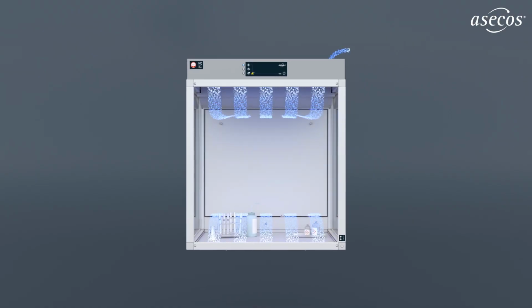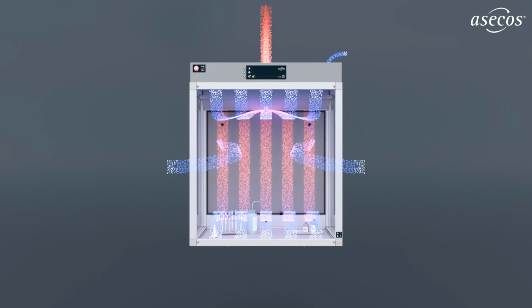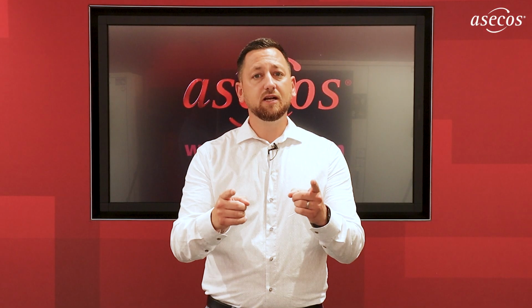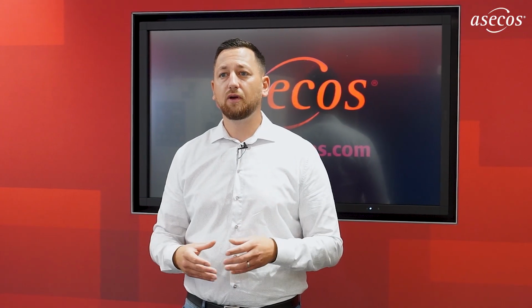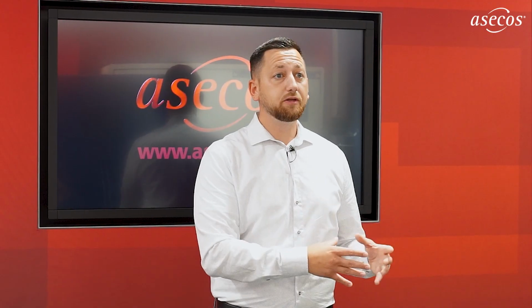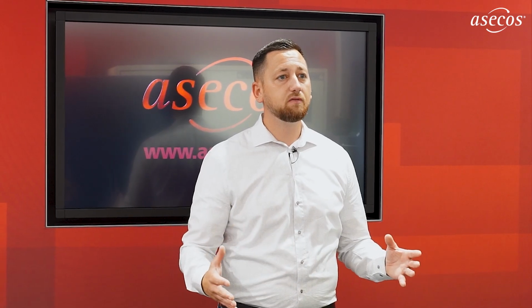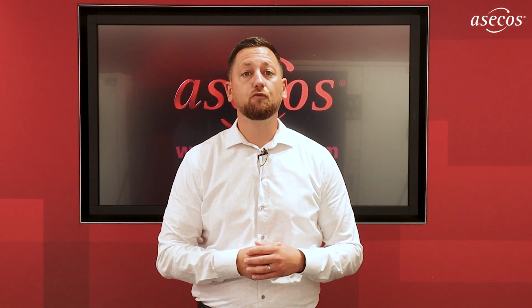By using the fresh air curtains in the upper and lower areas of the front opening and the extraction system on the rear wall, you as the user benefit from maximum freedom of movement and a highly efficient form of pollutant collection for all activities that do not require splash and splinter protection. An additional advantage is that it is possible to install the GAP on an existing work surface, for example as an enclosure for existing systems or processes.